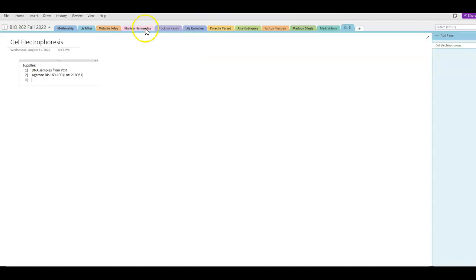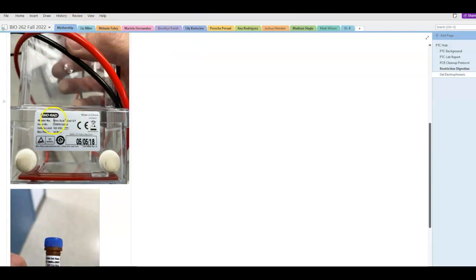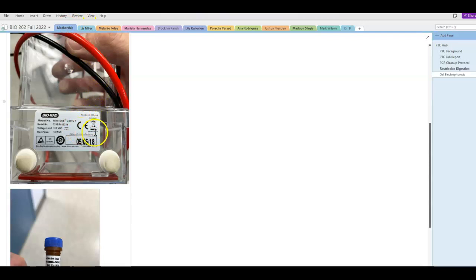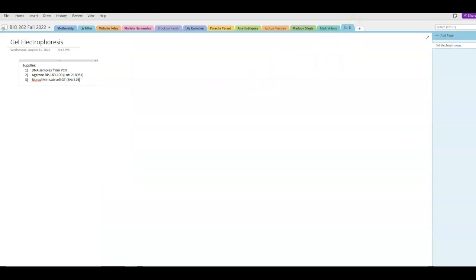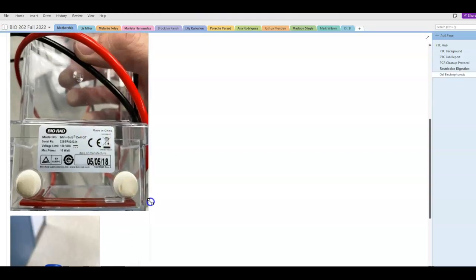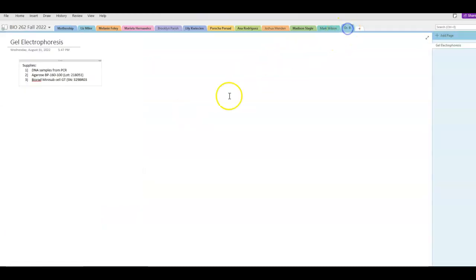Great. And then the next thing we used was the gel box. Again, I'm not going to write it, but you would then do that. Bio-Rad, or I'll do it, why not? Mini-Sub Cell GT. And is there any sort of serial number or anything like that? Let's go back and see if there is one. There is 329BR03, and there must be more to that. 5334. Or actually, it's hard to see. So, yep, 5334. See how I can make it bigger?